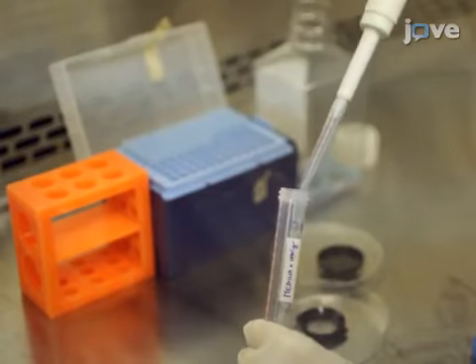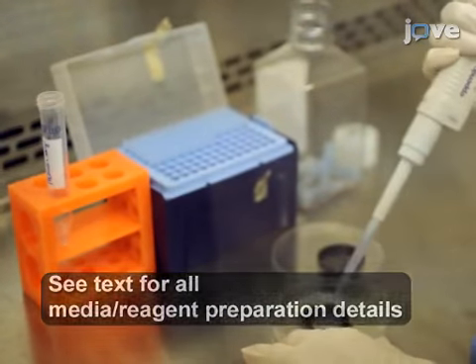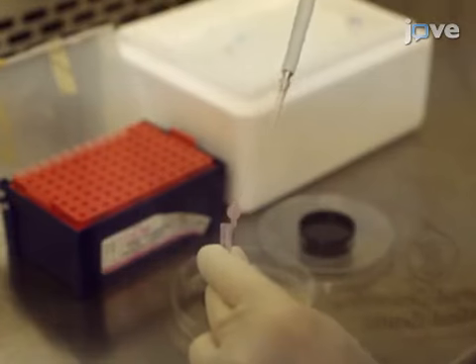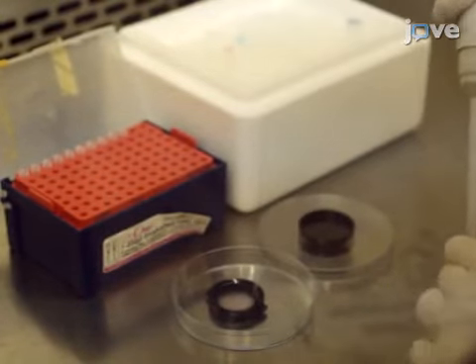The next day, replace the cell culture medium with fresh medium supplemented with interferon gamma to induce MHC2 expression on the endothelial cells, followed by stimulation of the cells with 20 nanograms per milliliter of TNF-alpha 24 hours later.